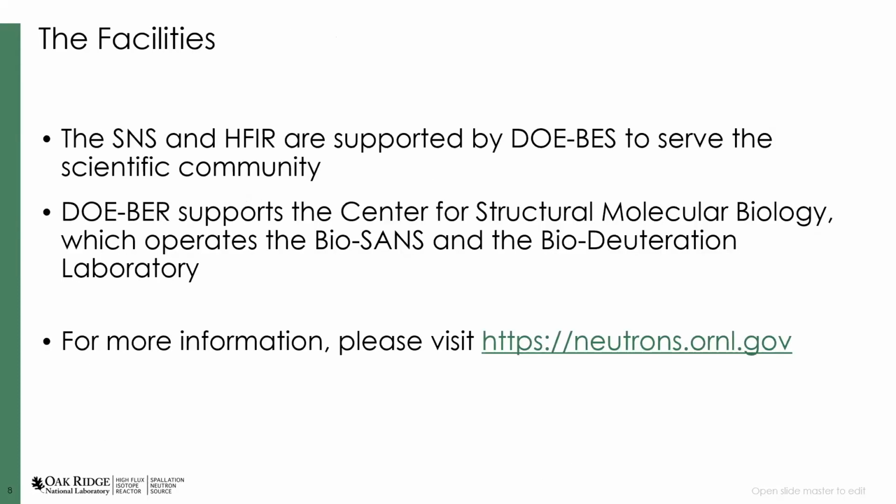All right, so it's important to note that the SNS and HFIR are both supported by the Basic Energy Sciences of DOE. Their mission is to serve the scientific community. So this is an important thing. These are open access user facilities. Anybody who wants to come and use the beams can do so. It's very similar to the model at the synchrotrons.